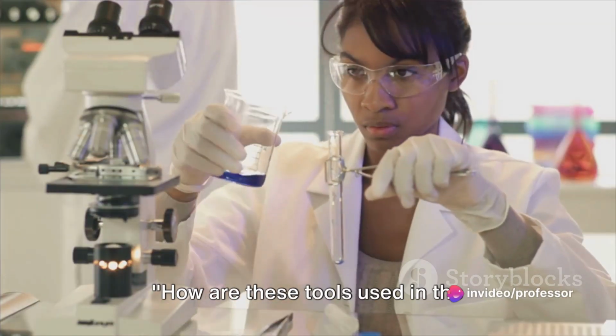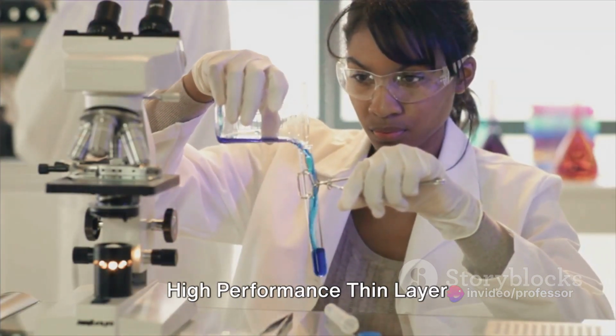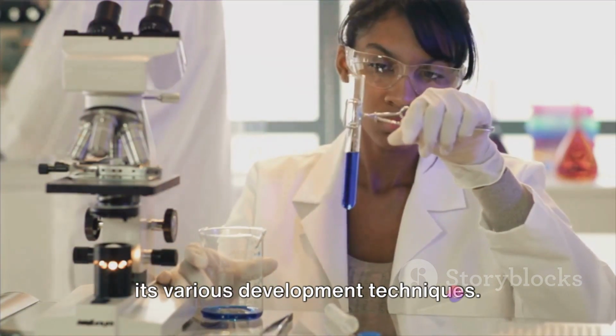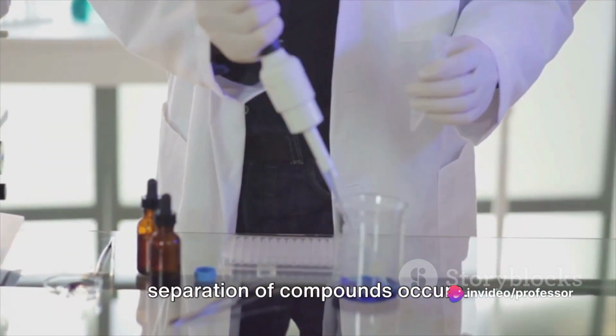How are these tools used in the development process? Let's find out. High-performance thin-layer chromatography, or HPTLC, is an analytical technique that is highly versatile due to its various development techniques. The development process is where the separation of compounds occurs.